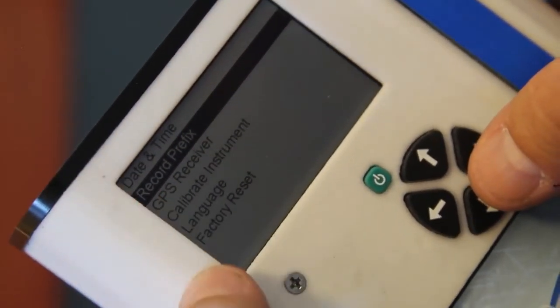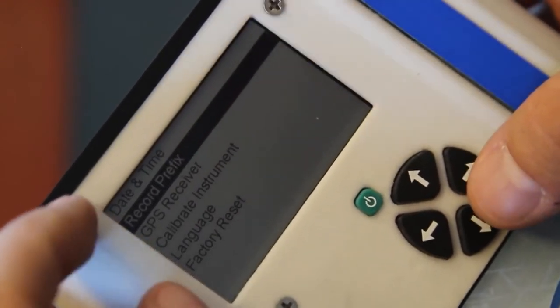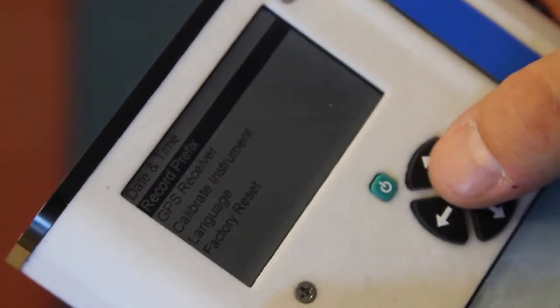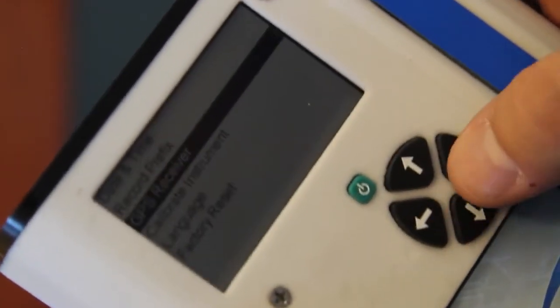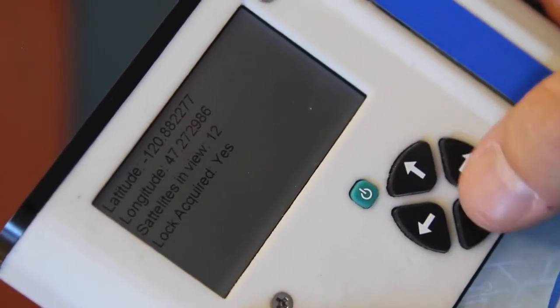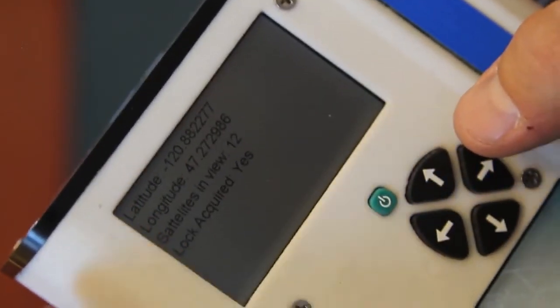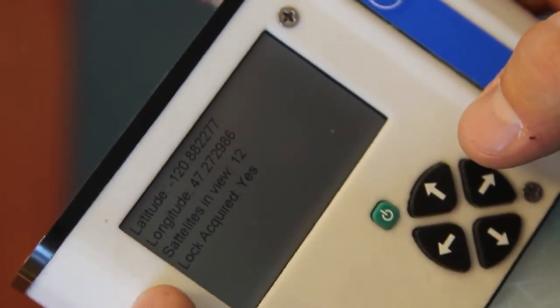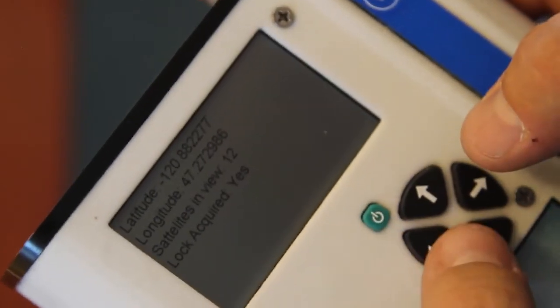Inside this setup instrument menu, we're given a number of other options. You can set the date and time, view the status of the GPS receiver, the longitude, latitude, satellites in view, and whether there's a lock acquired.